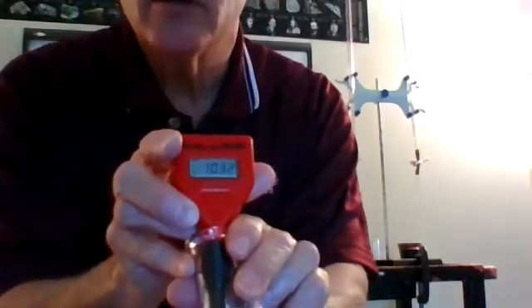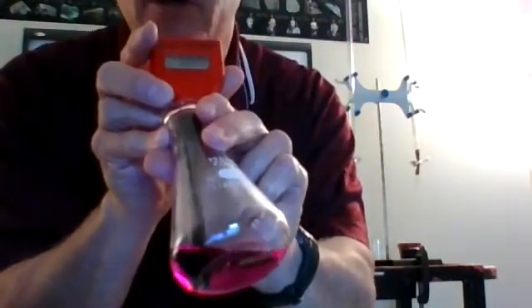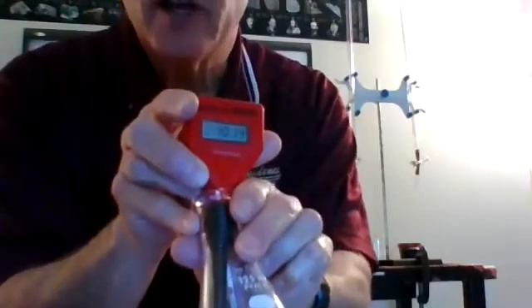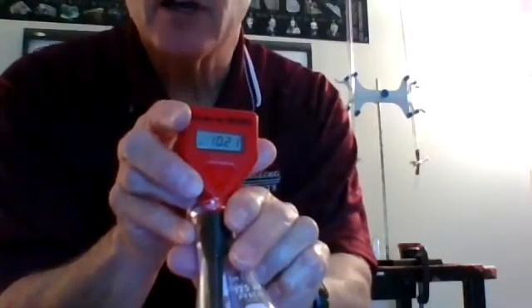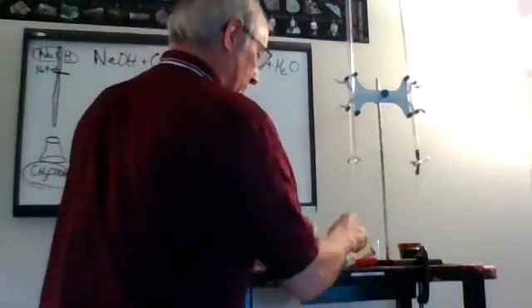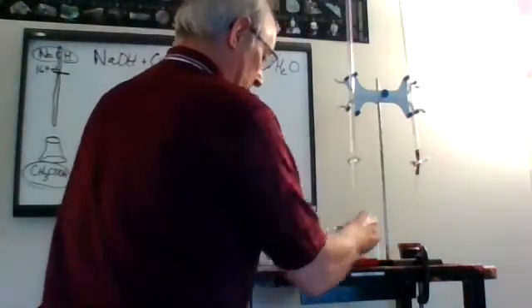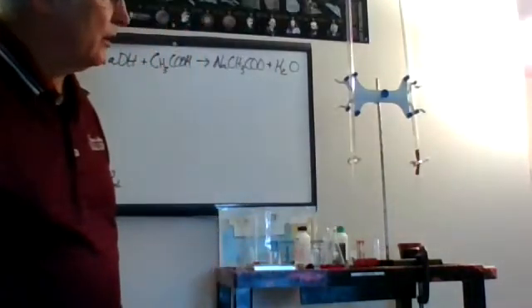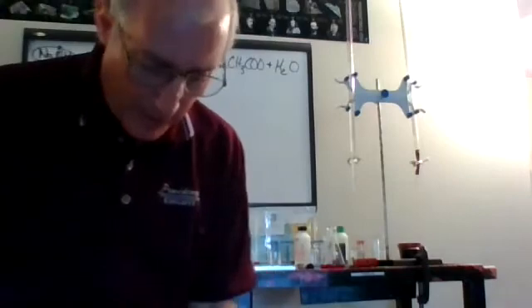There's 2 little probes down there on the bottom of this thing that determine whether or not it's a base or an acid, and if it is, how strong of an acid or how high the pH is. It looks like it's about a 10.5, which is above 7. So I overshot it into the basic range. Okay. Now, we're going to finish this bad boy up.